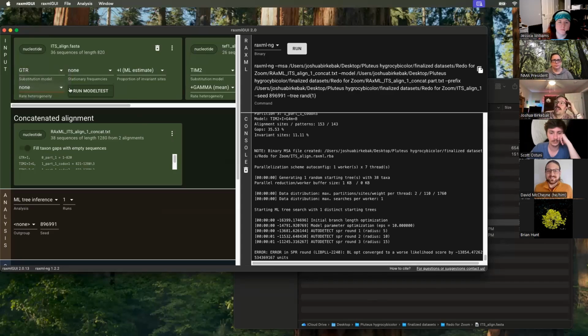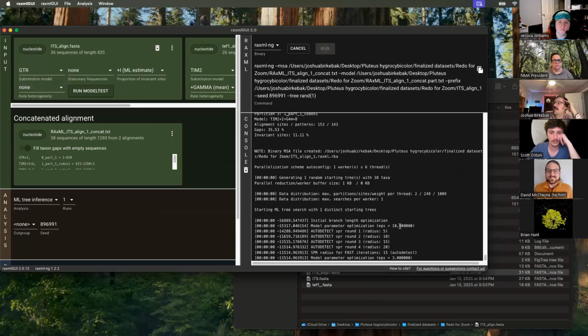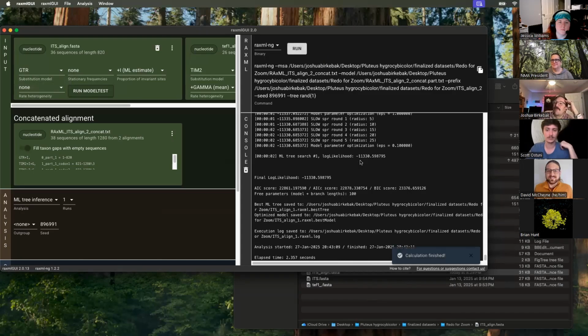Basically, just turn off the gamma parameter and then run it again, and it should work. It's something that is not perfect. It's something we're going to maybe have to try to figure out, why it keeps doing this. You can force it to keep running if you ran it in command line, but I'm not the kind of person that likes to run command line because I'm not very good at computers. And if I were better, it would make sense and I could do it. So if you want to, it's kind of awesome.